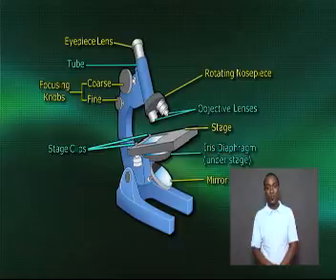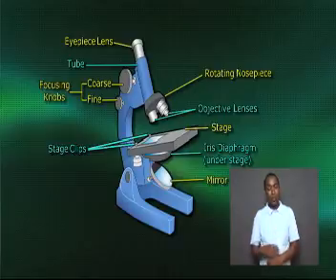In a compound microscope, the light passes through the specimen and through the objective lens. The image is produced at the eyepiece lens. It is highly magnified, upside down, and is viewed right to left.